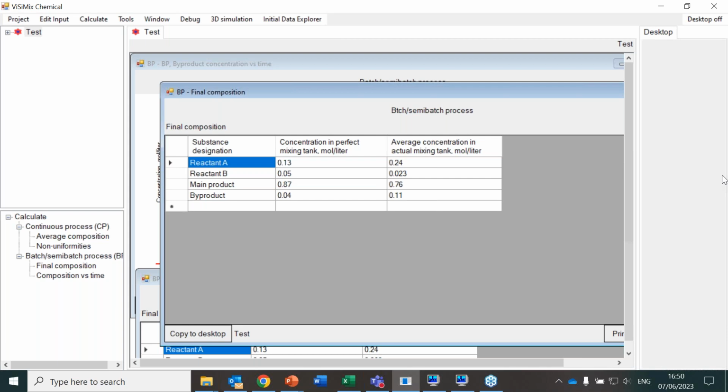This is really new. The software interaction with you, the screen, is a little different in order to provide you more capabilities to connect between the projects and the results and to compare between them. And this environment, we will of course implement more and more in our next products in order to give you the capability to, for instance, run a complete connection between the RPM and the result of the reaction.